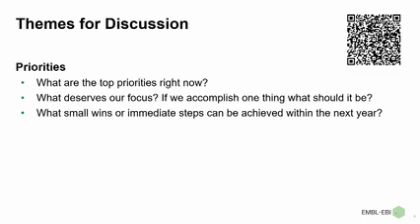Maybe I can pick on you, David. Do you have any priorities for the community? So I think there's perhaps a couple. One, I think it's really important to be able to work with the software developers, the ones working in MS-DIAL or MZmine or XCMS and others, to make sure that the formats that they're producing, the data that they're capturing, is in a format that we could just basically click once and upload to the repository.